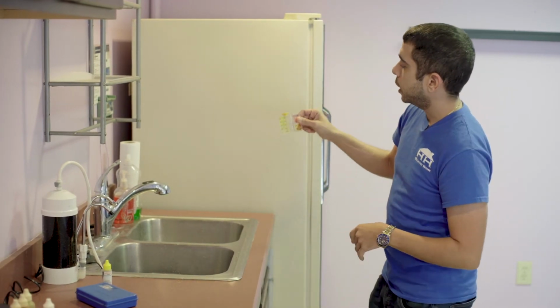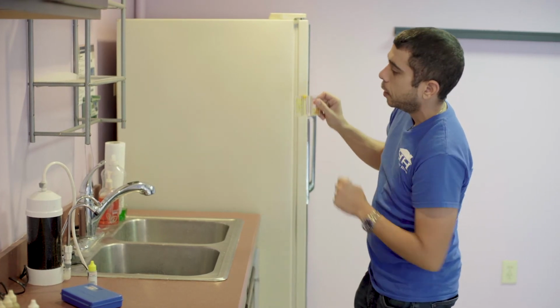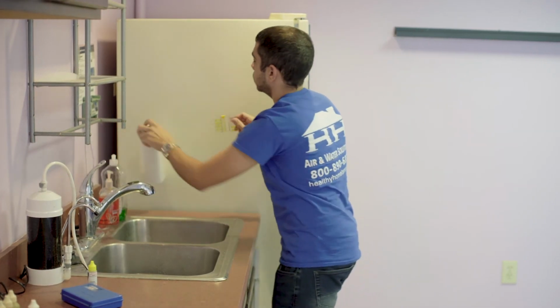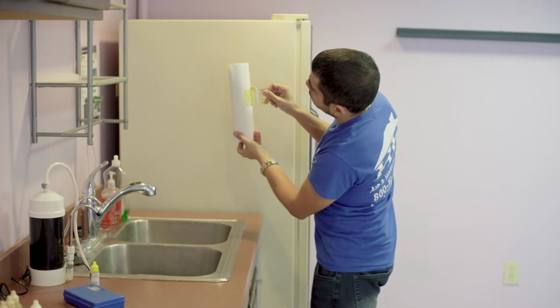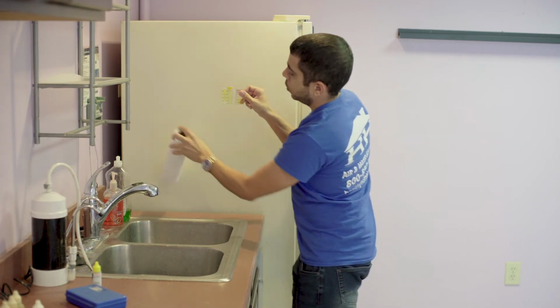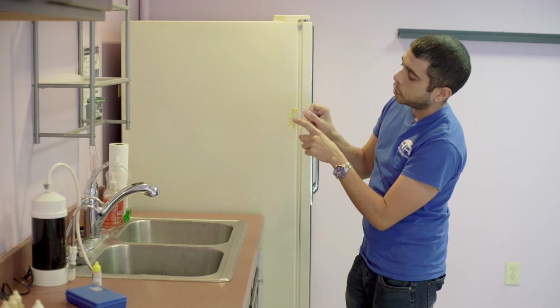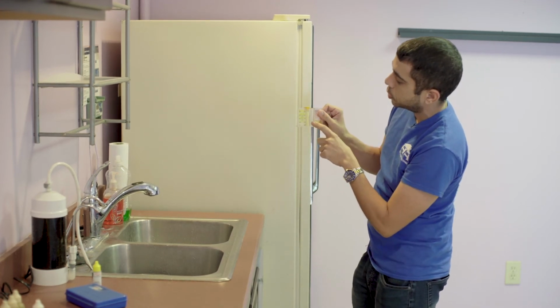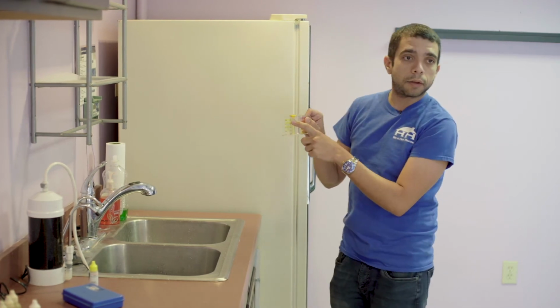Right now, if we were to picture this with that right next to it, and let me try and find a little wider of a backdrop. Check this little guy out. Now you can see, wow, definitely a lot more yellow, and it's getting stronger by the moment. As of now, it's already between the 1 and the 2, and quite frankly, it's starting to get so yellow, that's really yellow. I would say it's hitting that 4 marker.